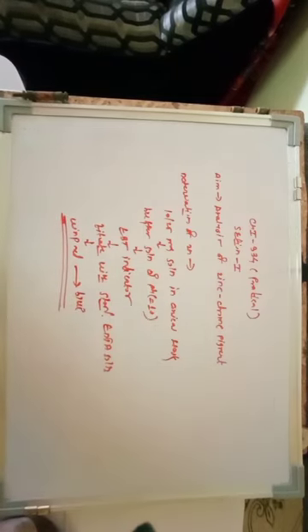So this is the simple procedure by which we can determine both chromium and zinc volumetrically. For determination of chromium, we use iodometric titration, and for determination of zinc, we use complexometric titration. To maintain the pH of the solution at 10, we add the EBT indicator and titrate with EDTA solution. Wine red color changes to blue.